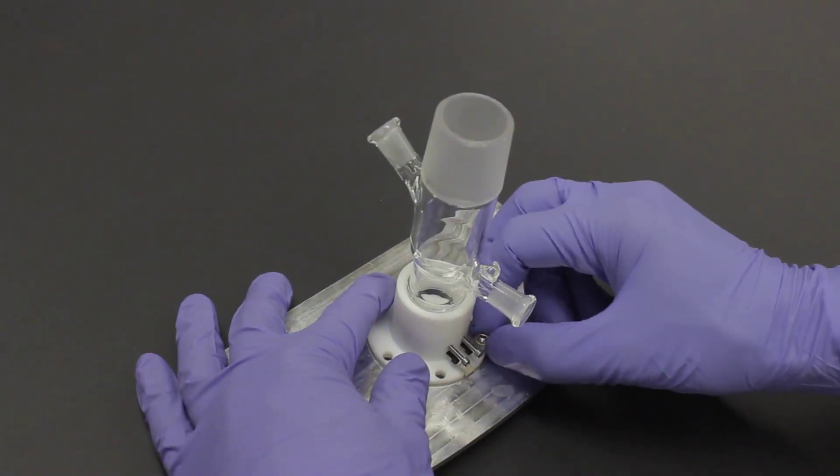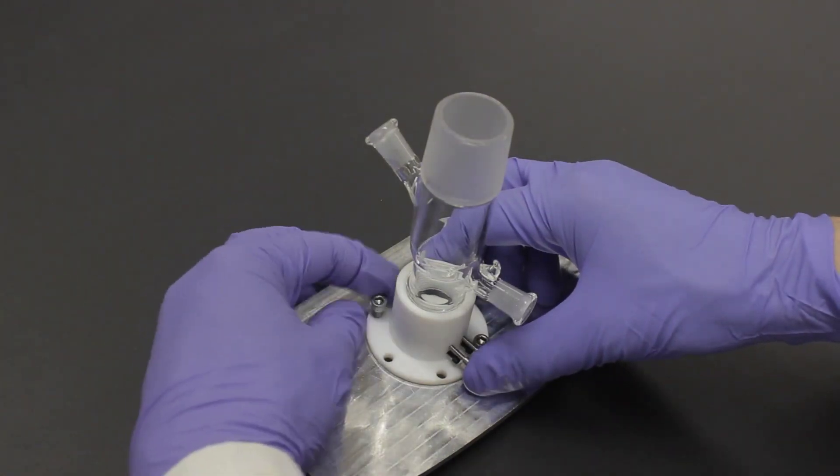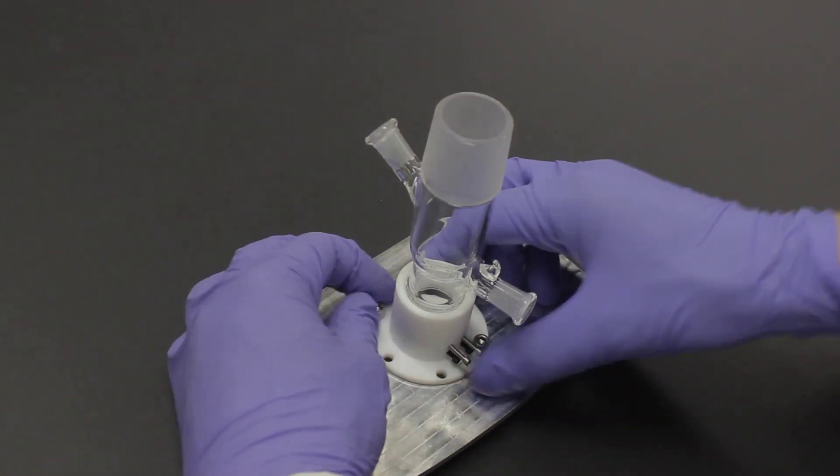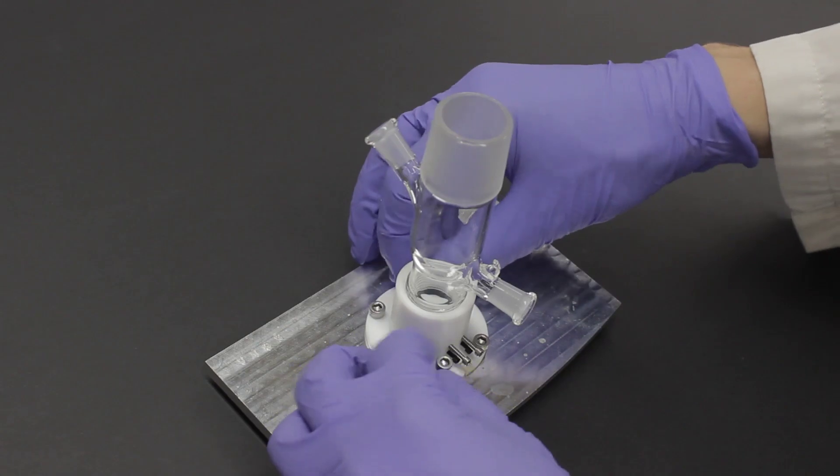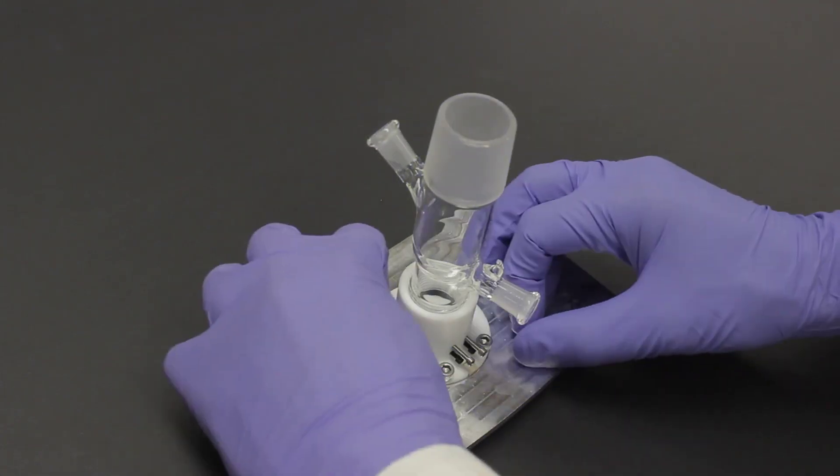Take extra care when fastening the cell if using wafers, as they are quite delicate. Tightening the screws by hand is sufficient. Take care not to over-tighten. If there is a leak, you can always tighten the screws a bit more, but if the wafer breaks, you'll have to start over with a brand new wafer.